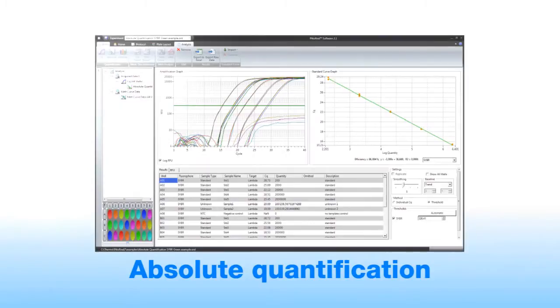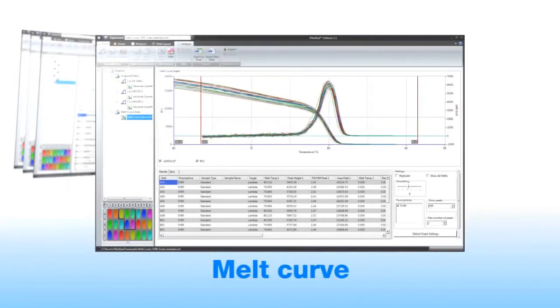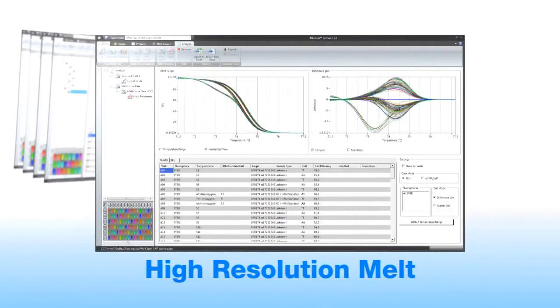The PicoReal software has the analysis modes for absolute quantification, relative quantification, allelic discrimination, melt curve and high resolution melt analysis. It also includes a color calibration utility for dye customization.